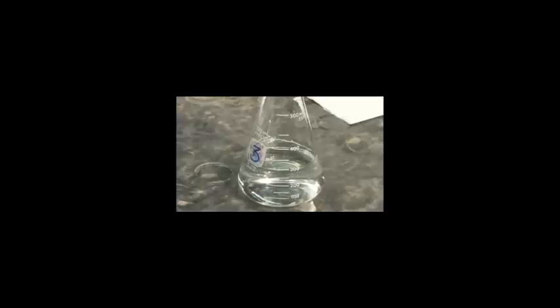And then once you add your 90% consumption of KMnO4, you can swirl your solution until it becomes colorless again. So in step 6, we added KMnO4 to our 90% consumption, and then we swirled it until the solution became colorless again.